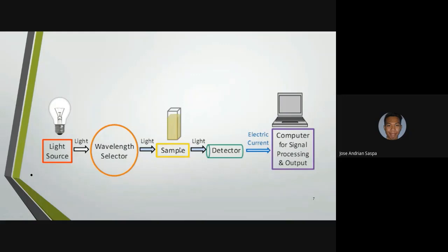In UV-based spectroscopy, samples are mostly liquid. Why liquid? Because if we use a liquid sample, it is a non-destructive, rapid method of analysis, and easy to determine the absorbance, reflectance and the transmittance of light from the sample.